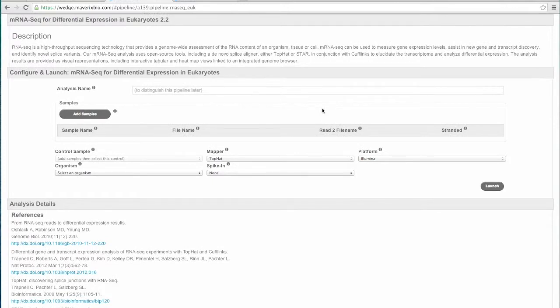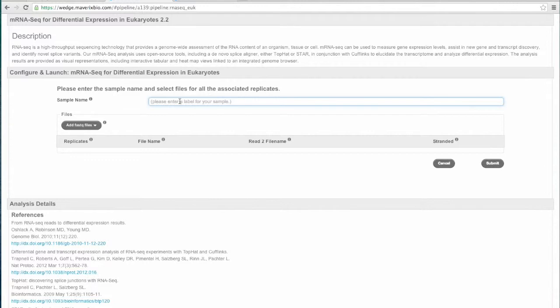So now I'd like to configure and launch an example analysis. So all you would do is begin by giving this an analysis name. So I'm just going to call mine mRNA-seq analysis 1. This label that I give it is what will be associated with that analysis as it moves through the platform. And in addition, this would be the label that you would see in the analysis execution history. I would click Add Sample, and I would begin adding my first sample.